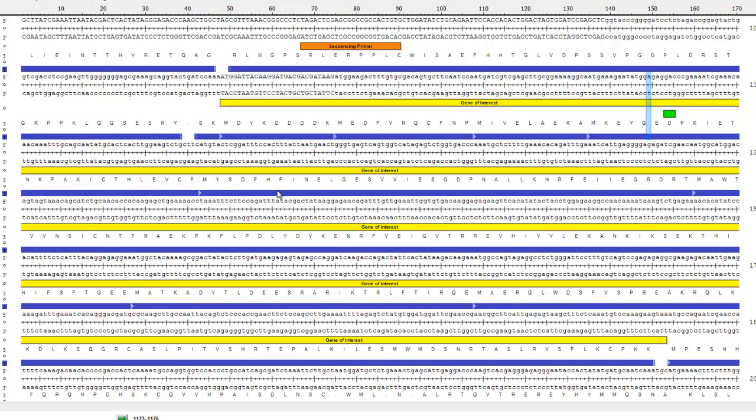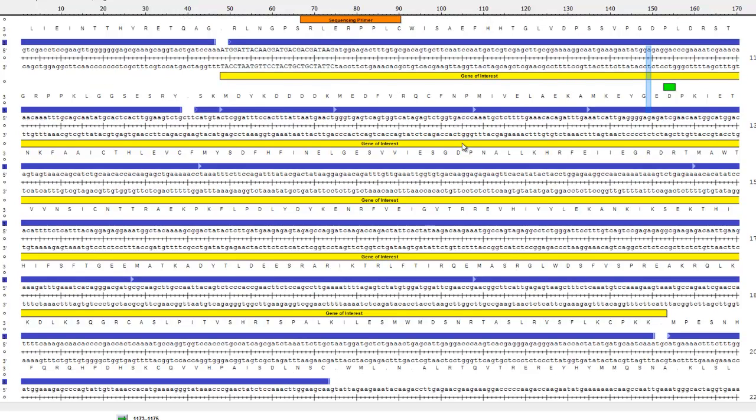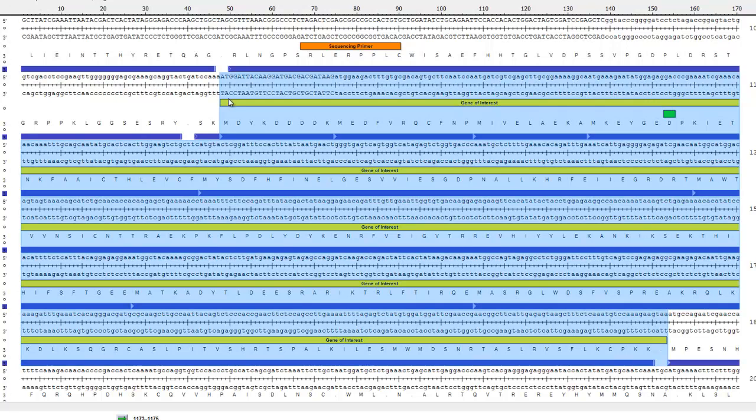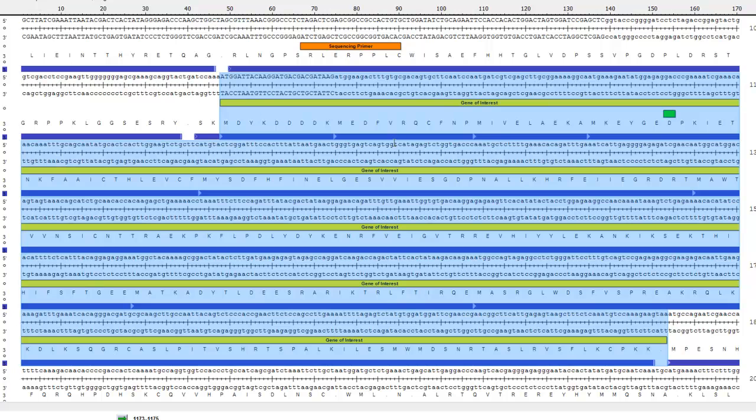That's pretty much it. The blue is just basically showing the open reading frame. This is showing where the ATG is that's going to be encountered when it starts to translate the messenger RNA. And it's going to just translate, starting here, this open reading frame, all the way to the end. And here we have the stop codon in the end, TAA.